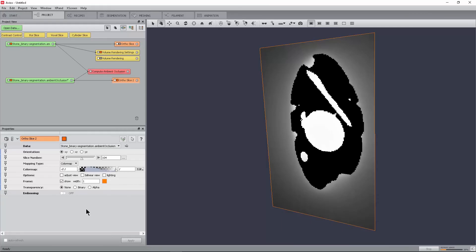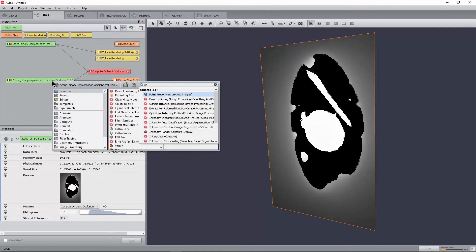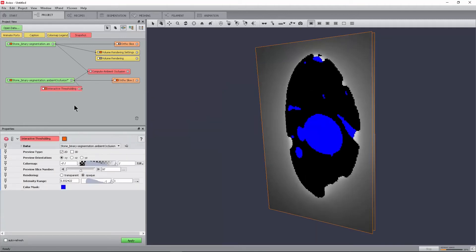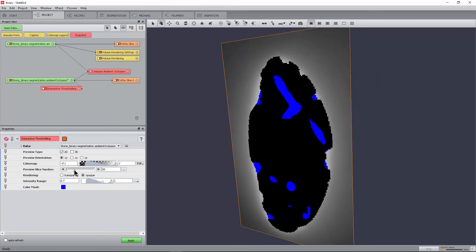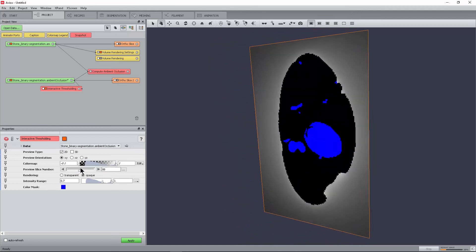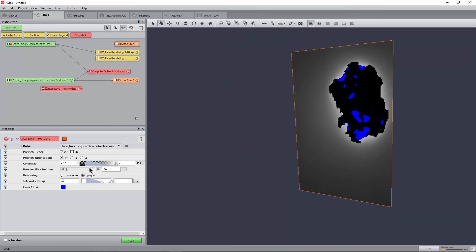We will now perform the cavity segmentation. Select the ambient occlusion field in the object pool and attach an interactive threshold module to it. Go to the intensity range port and set the lower threshold to 0.7. Our experience has shown that this is a suitable range for many datasets to compute a threshold segmentation from the ambient occlusion field. Press the apply button.